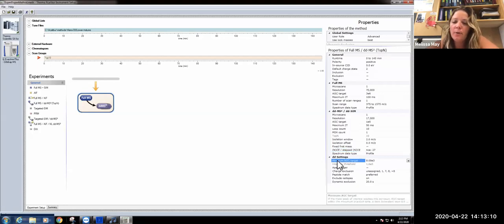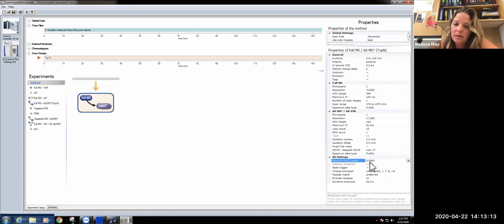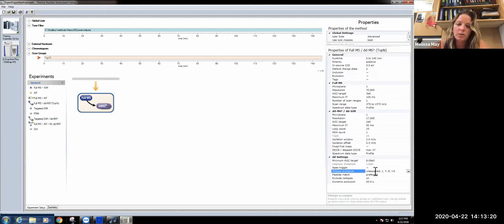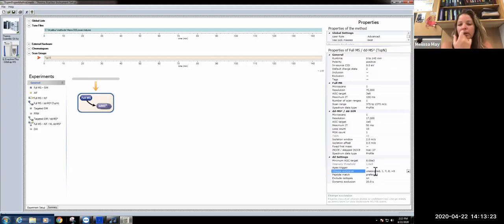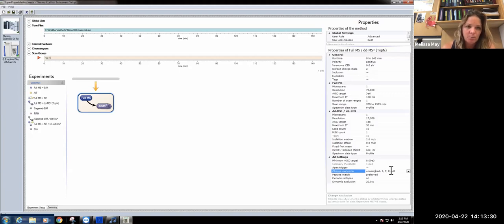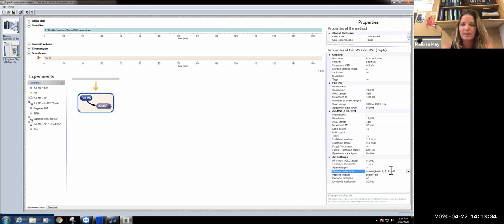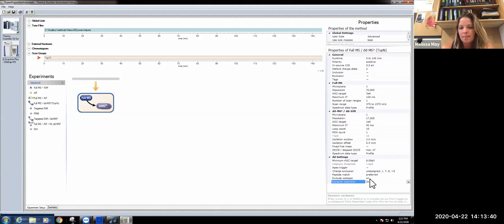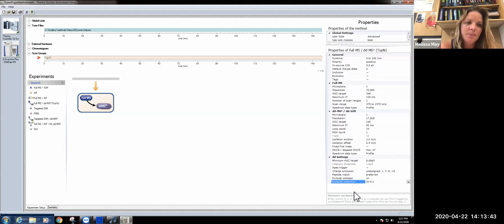For the data dependent settings, the minimum AGC target is pretty standard. We do charge exclusions. Because we're specifically interested in looking at peptides, we don't care about anything that has a charge of one, seven, eight, or greater than eight, because those aren't going to be peptides that have been digested with trypsin. The dynamic exclusion is going to be 20 seconds.